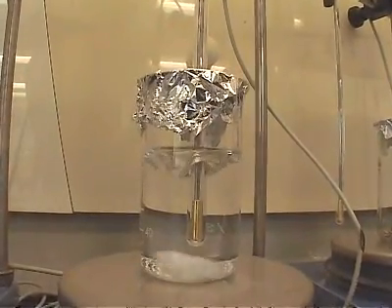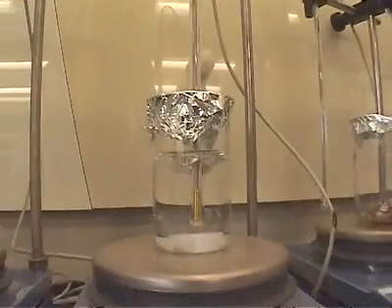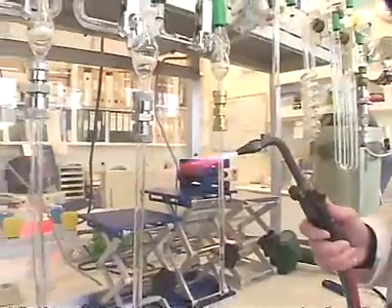In radiocarbon dating, it's very important to remove any contaminating carbon. So the second step in the procedure is to give the sample a series of chemical washes to remove any material that might have been added to the original carbon after it's been in a burial environment for some time. Then we go to the third step in the procedure. After the chemical washes, the sample is dried, and the third step is combustion.